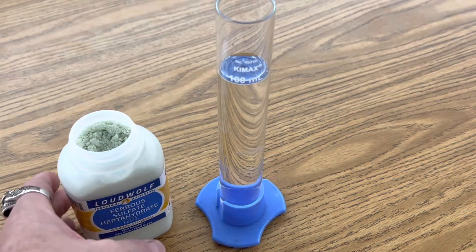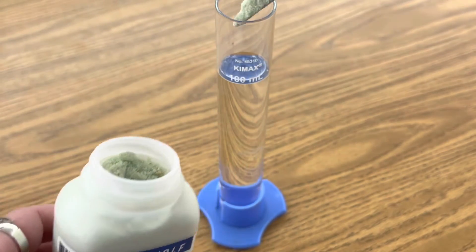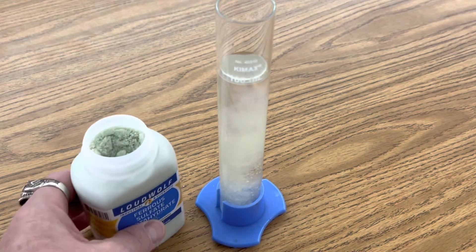Next, create an aqueous solution of iron sulfate by adding 4 grams to 100 milliliters of distilled water, and stir it until your solution is aqueous.